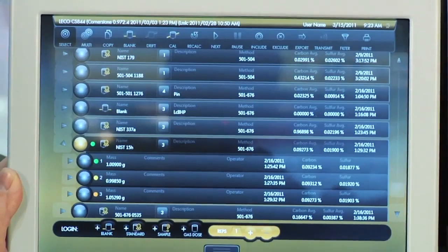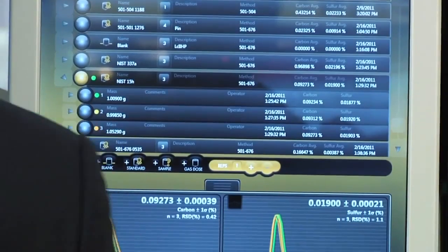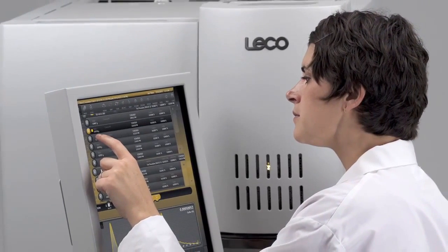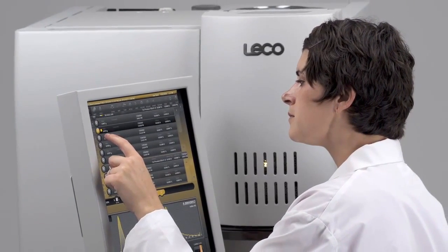The first of which is our touch user interface here on a touch screen, boom mounted to the instrument. The goal of this touch user interface was to provide a rich and dynamic user experience to allow ease of use.